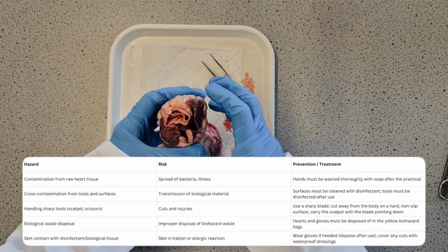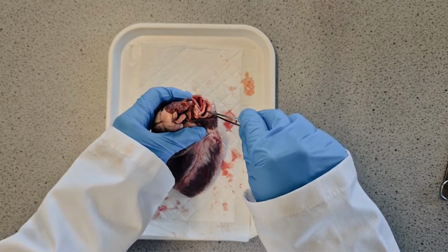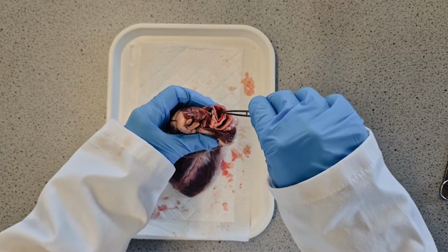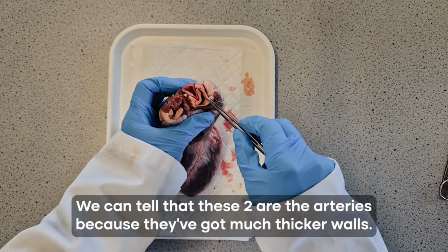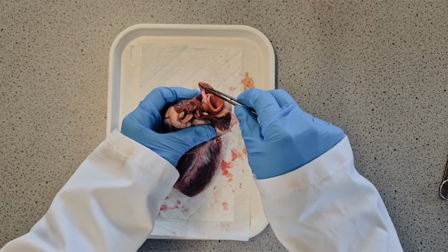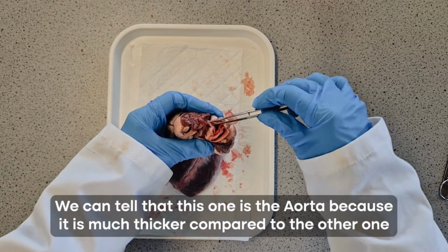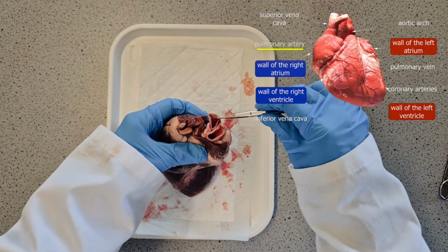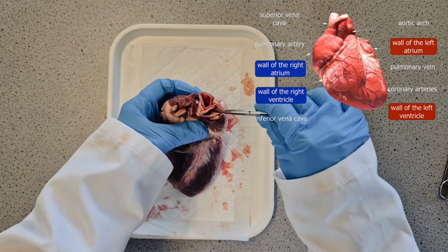Now the blood vessels, I have got 2 that are still intact here that we can see. We've got here the aorta, and we've got the pulmonary artery. We can tell that these 2 are the arteries because they've got much thicker walls. So they've got a thicker muscular layer in the wall as well as that thicker elastic layer. And we can tell that this one's the aorta because it is much thicker compared to this one over here, which would be the pulmonary artery, which is taking blood away from the heart to the lungs, whereas the aorta is taking the blood away from the heart to the rest of the body.